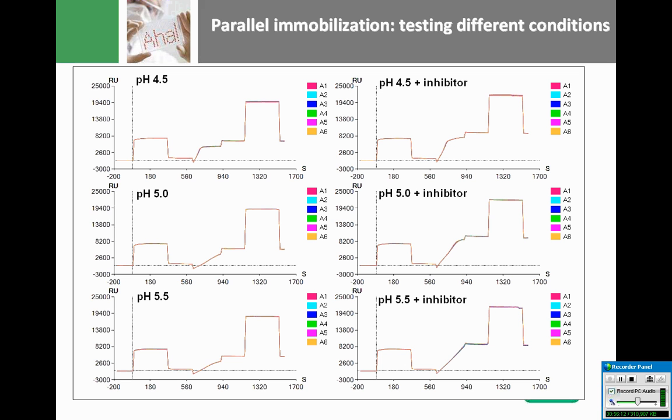had a target protein, but they knew that just normal immobilization of it over the chip eliminates its activity because the binding site is lysine rich, and therefore those lysines will interact with the carboxylic groups, and the active site, the binding site of the protein, will not be available to bind these small molecules.